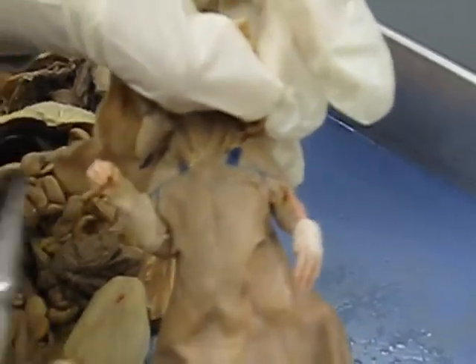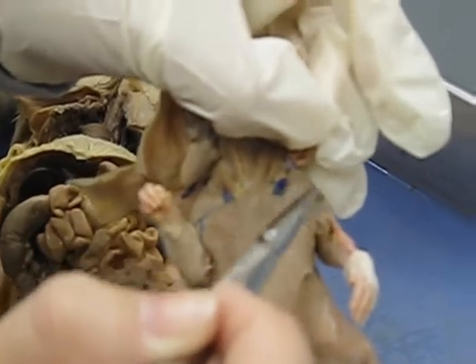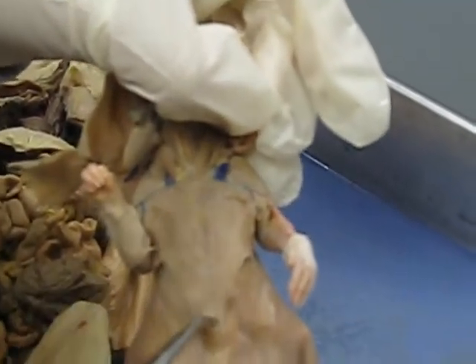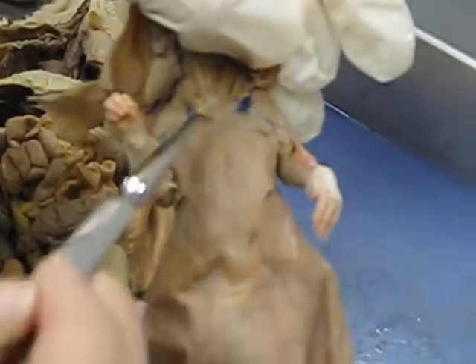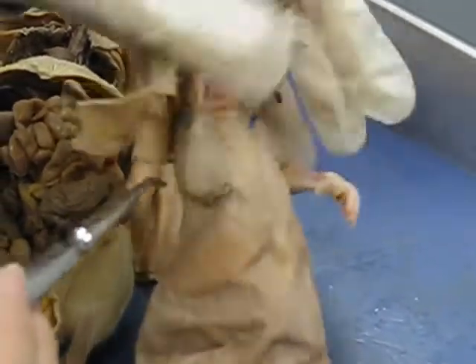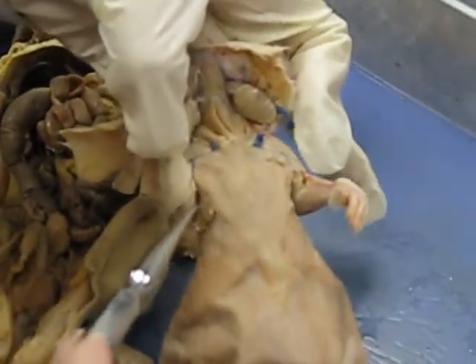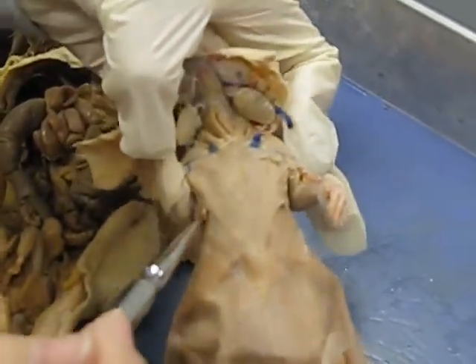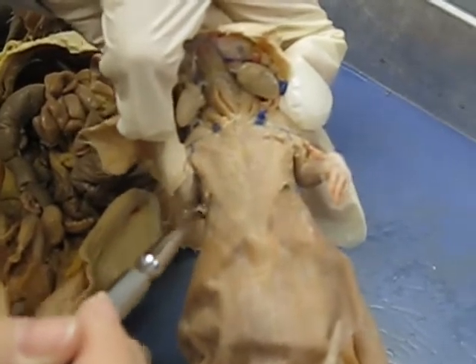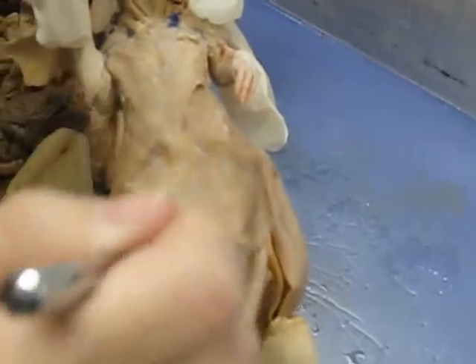Then you have the kleidobrachialis, which is basically the shoulder muscles. And you have your pectoralis, which are in the center — these two very large muscles. And then your cutaneous trunci, which is basically the muscle that you cut from the skin; it's always going to be under the armpit. Then down here you have your external obliques, this really large muscle.